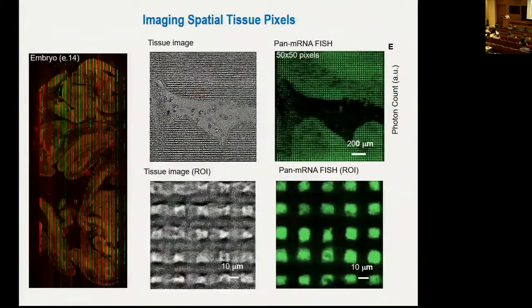Worth noting, this is exactly the same tissue we're going to take for sequencing, rather than the previous methods, which always have to compare to the adjacent tissue. They are not able to get any good image from the same tissue at all. Also, the tissue sample we analyzed is just a formaldehyde-fixed tissue sample on a glass slide. So if you have a freezer of those samples banked, we can look at those samples as well. We don't have to use a frozen tissue block and a fresh section put on our slide.